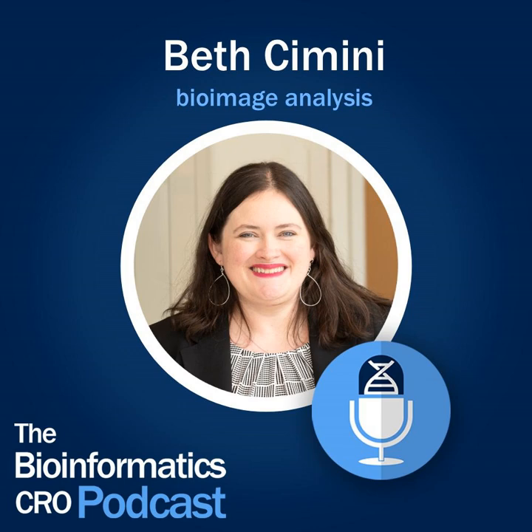And so it's very hard to cleanly separate what's a quality issue and what's actual interesting biology, because we're doing detection of the things we care about and phenotyping of the things we care about all in the same step. It's not like sequencing, where we can measure if we're getting a good read and then make inferences once we've collected our read.